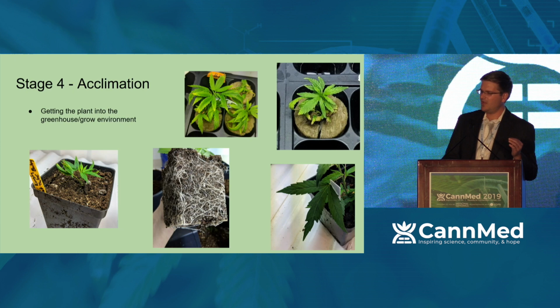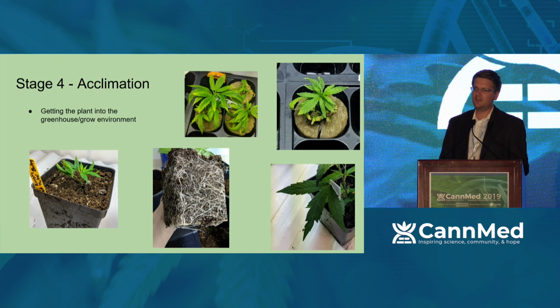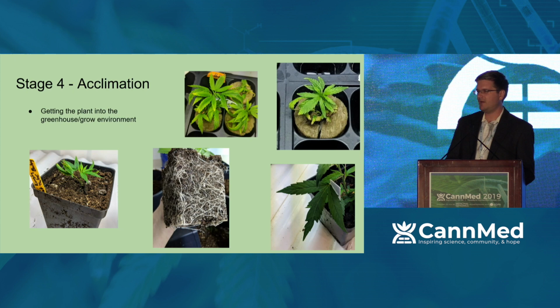Now, at times, if you look at the bottom right picture here, you'll actually see some of the plant tissue is deformed, or the morphology of it was not correct. That means my initial hormone blend when I was culturing that plant was not what it should have actually been. You'll see different serration issues and things like that. And within about 2 weeks of pulling it out of the tube, it'll revert back to its normal state. You won't even know it was there. But it is good to mention that those type of things can happen coming out of in vitro culture.